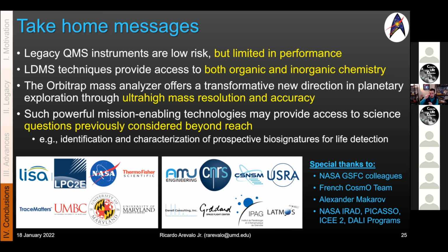organics as well. It's just, we typically think about those as being in these residues. But I don't know, I'm rambling again. I'm going to end there. So I'm going to say that we're approaching these parts per billion level detection limits. I think that's where a number of elements are in the LIBS detection limits as well. Now LAMMS, I'm less familiar with firsthand, so I don't want to speak out of turn for that.